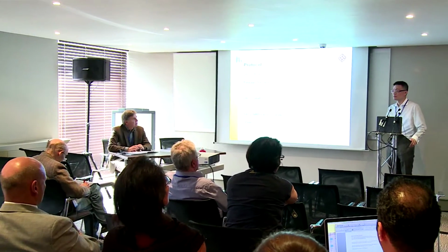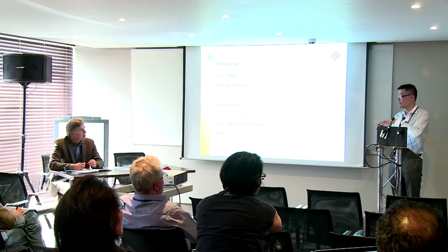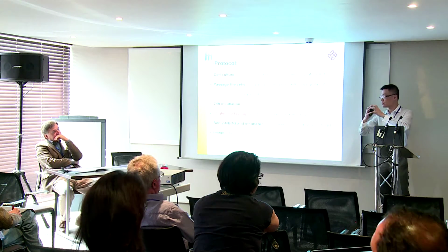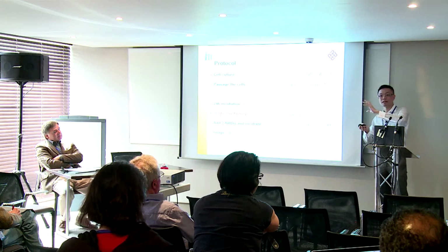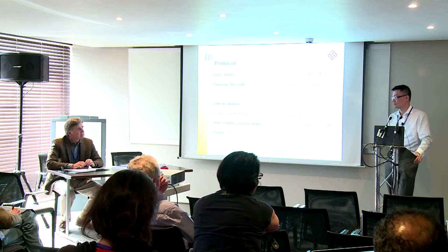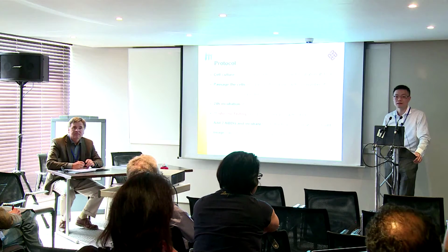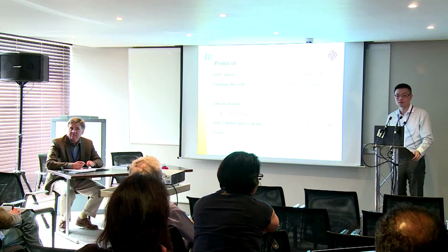Yes, if you use plastic, then I think the adhesion property will be changed. So we want to demonstrate this for migration purposes. At the very beginning of the migration, the cells become round in shape, and then they detach from the bottom of the dish, and then they can migrate. If you're using plastic, I don't know whether this kind of property will change. Is it also that glass is better for imaging as well? Yes, for fitting this kind of microscope, the thickness of the bottom matters too.